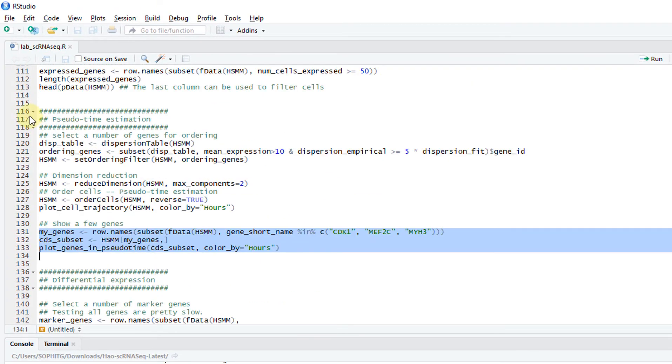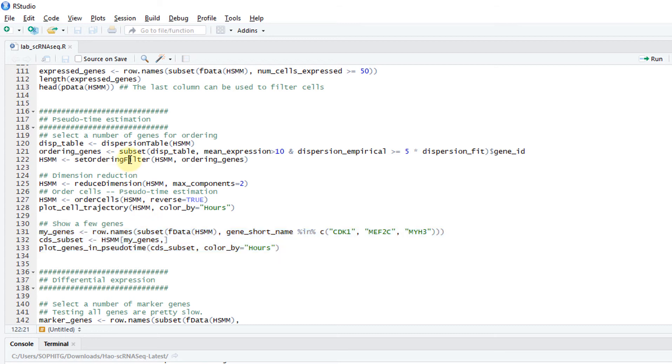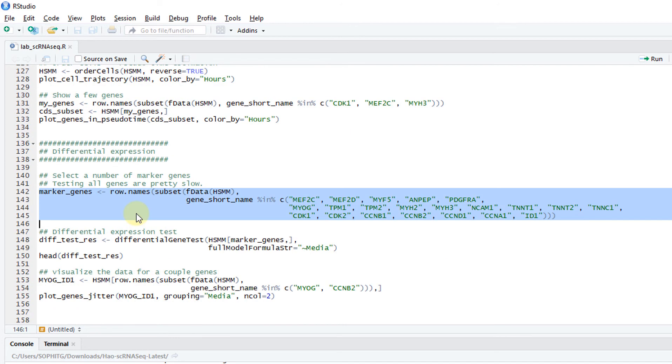This is the pseudo-time estimation. Estimation is basically just follow the steps. You set a filter. You reduce dimension. Then order cells. Basically, these three commands are the most important ones.